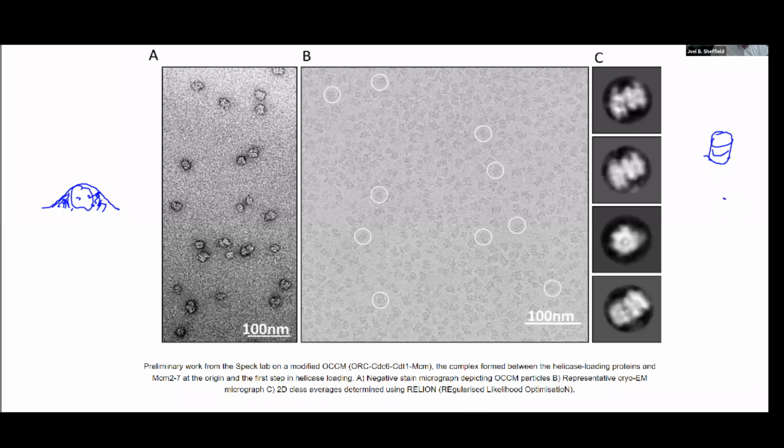And that thing lands on a flat surface. Well, one of the views of it clearly will be a view where it lands directly on the surface with its short end sticking into this thing, right? So you just have a view of a cylinder going straight down. You might equally well have a sample in which the unit is sitting on its side like this. And so you would see both of these as profiles of the structure.